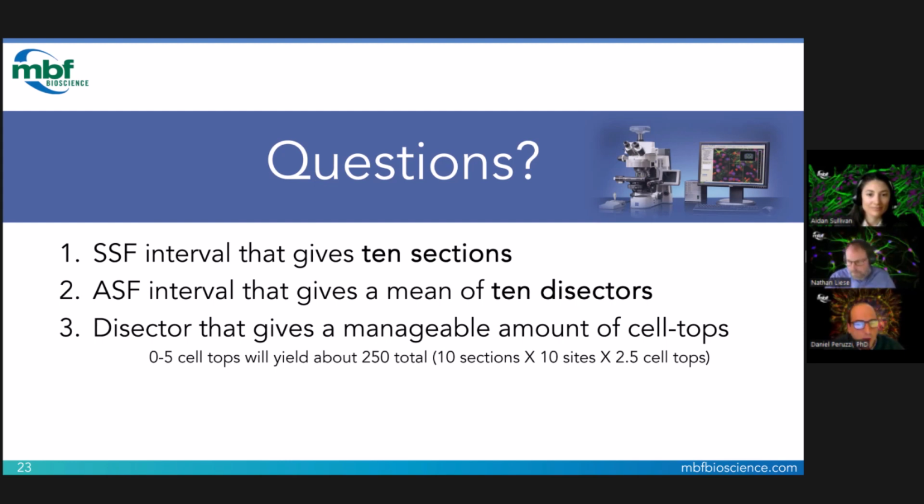And that is fine, because if you remember, the formula is N equals Q minus times 1 over the volume fraction. So the estimate equals the raw data that you count. We take that raw data and multiply it by the reciprocal of the volume fraction to extrapolate the raw data to account for places where we did not count. So N is proportional to Q minus, and if we add 0 to that Q minus, it does not affect the estimate.